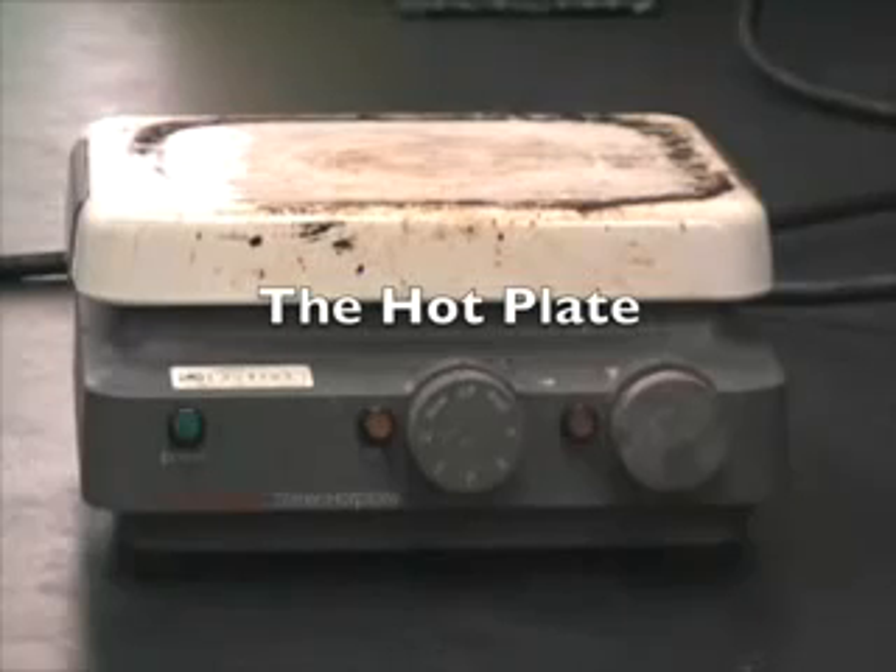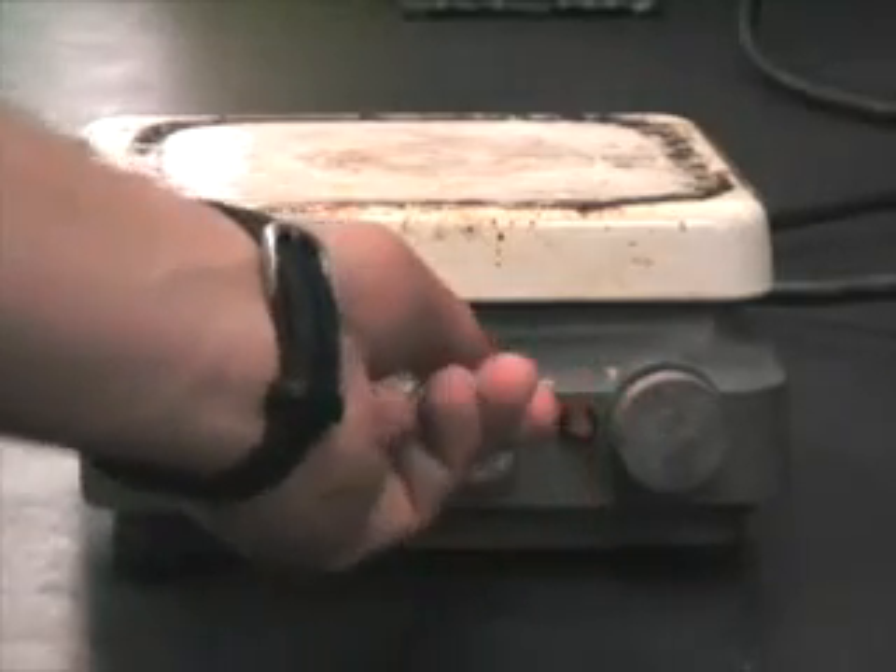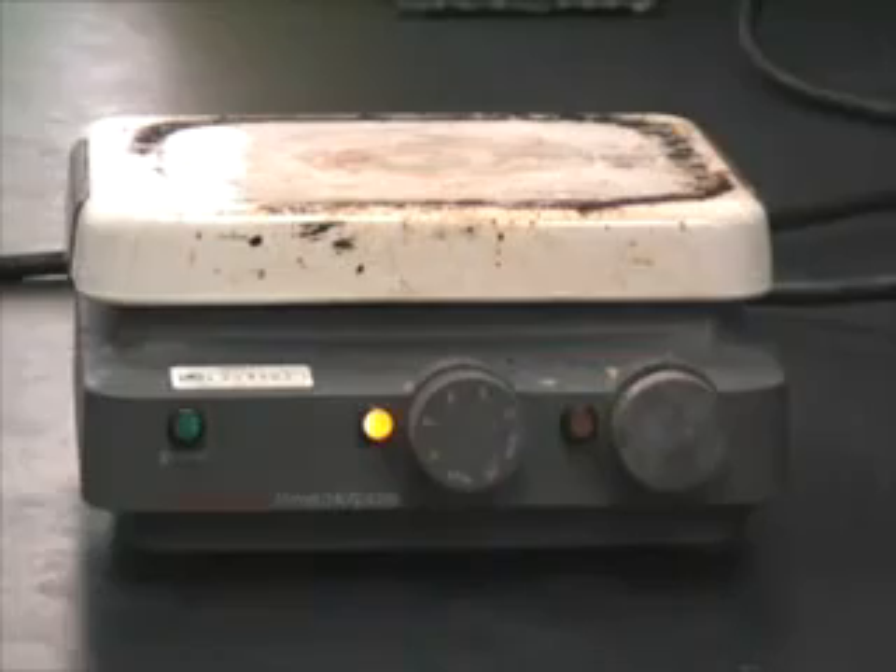The hot plate is a tool we will use often in our chemistry class. This one has an optional built-in magnetic stirrer. To activate, simply twist the knob till it's on, and twist off when not in use.